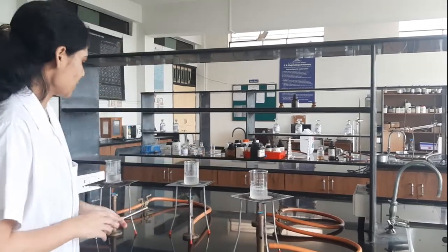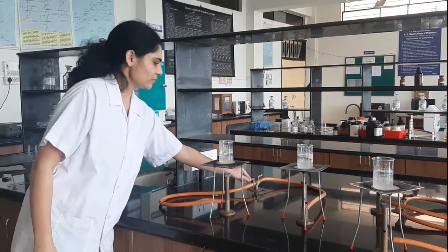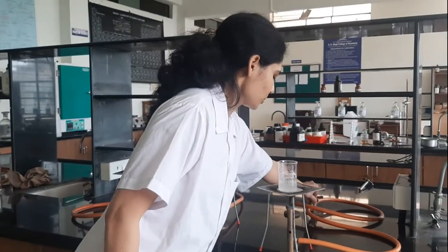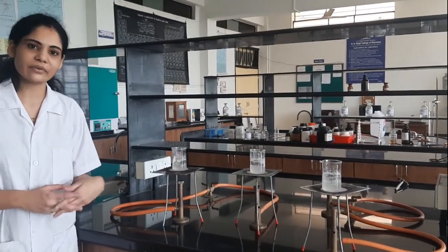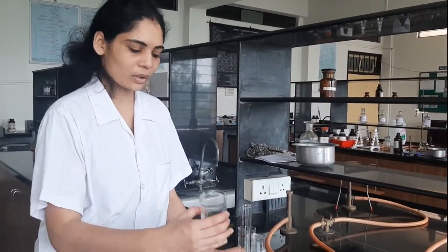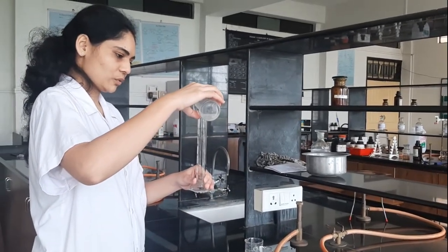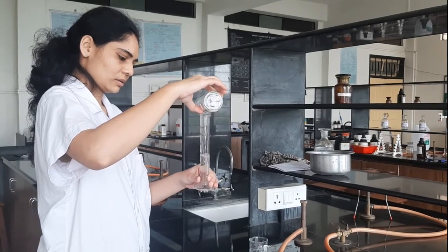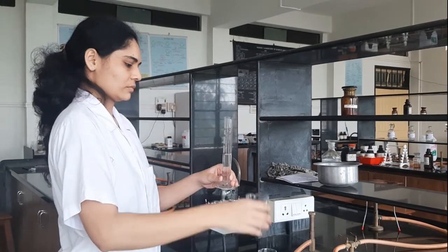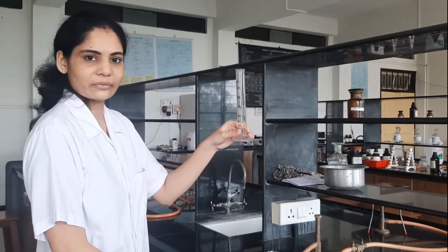Okay, now we have started the timing. We will wait for 10 minutes. Our 10 minutes are over, and we will stop these burners, and we will wait for 2 minutes so that these beakers get cooled, and then we will measure the volume. So now our beakers have cooled, and we will first take the 10% solution of NaCl and measure what volume is remaining. The volume remaining for the 10% solution is 30.5 ml.